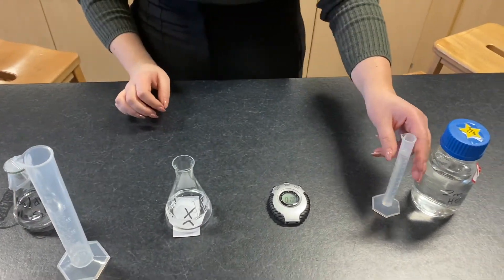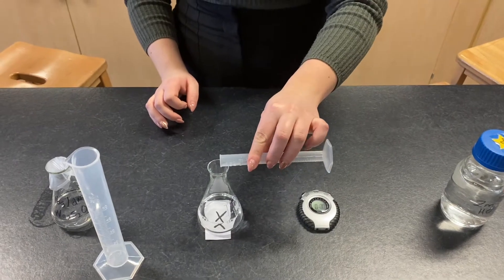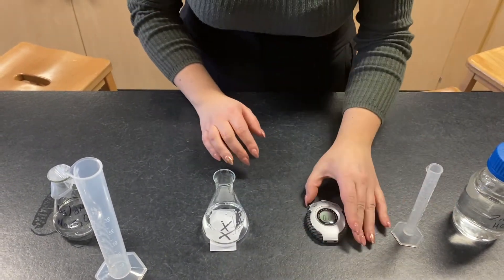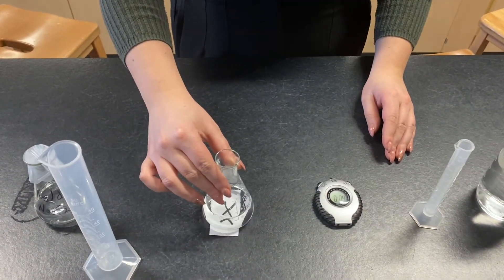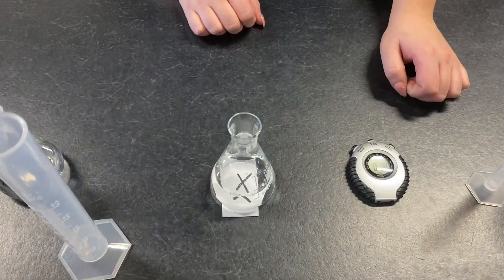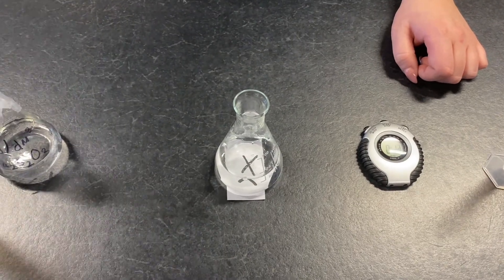And then we're going to add our 10 centimetre cubed of hydrochloric acid and then we're going to start our stop clock. We're going to stop the stop clock once we can see that the X has disappeared.